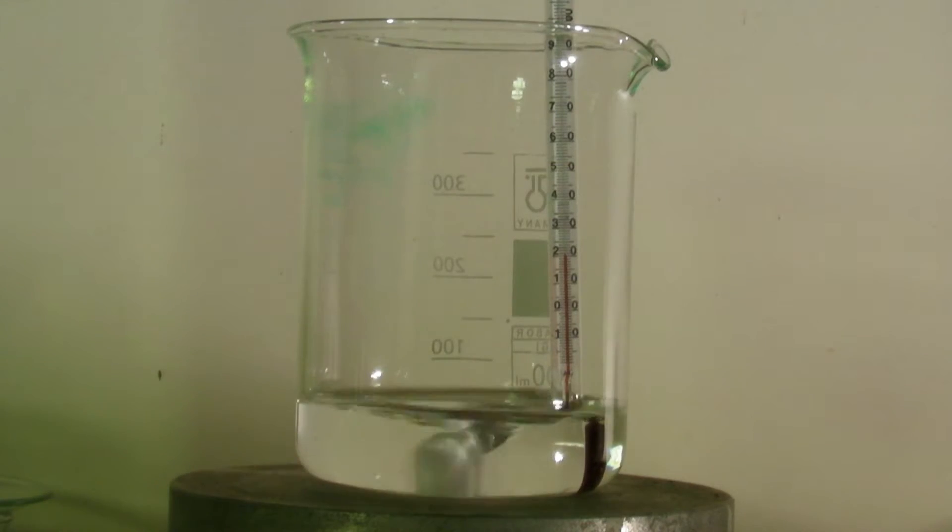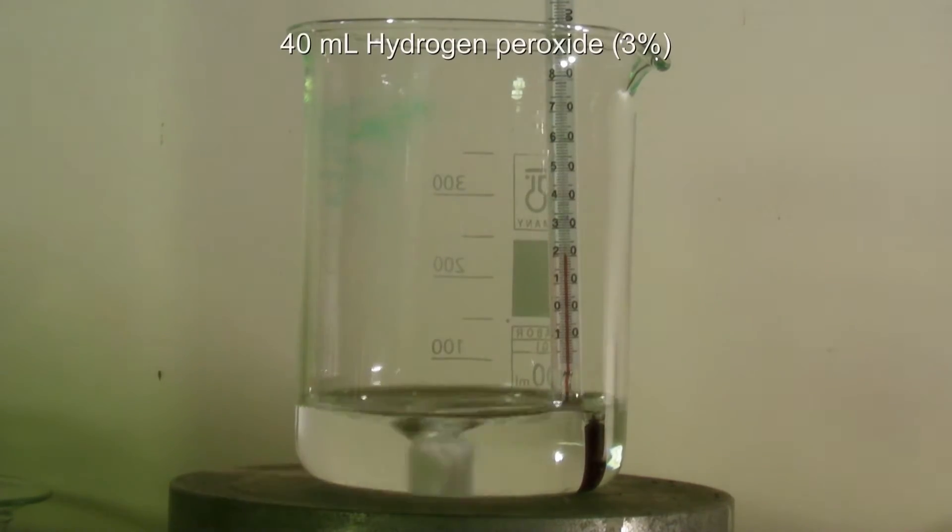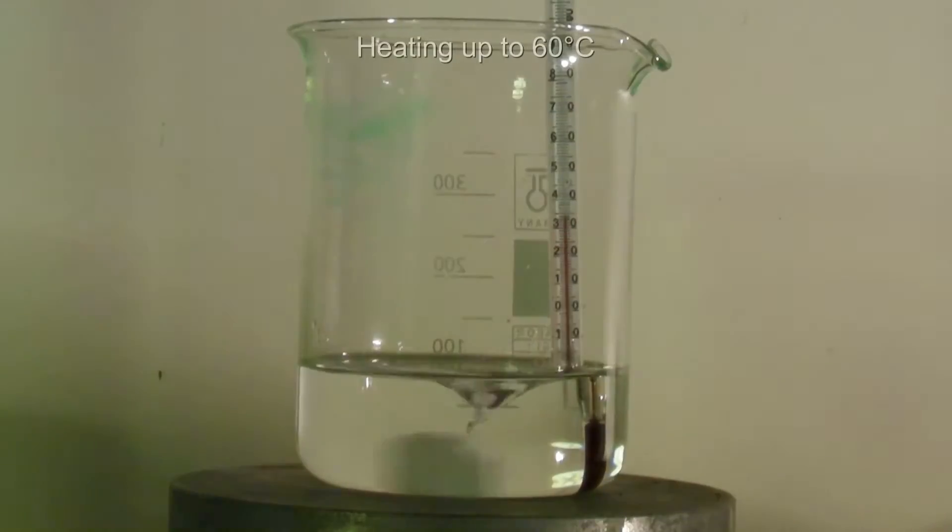To a 400 milliliter beaker, 60 milliliters of a 1 molar solution of potassium-sodium tartrate in water are added. Next, 40 milliliters of 3% hydrogen peroxide are added and the solution is heated up to 60 degrees C.